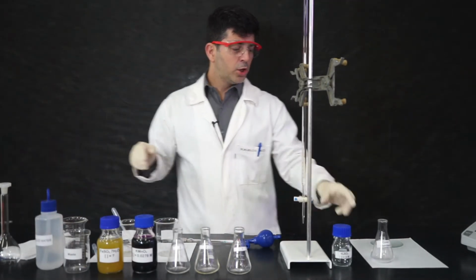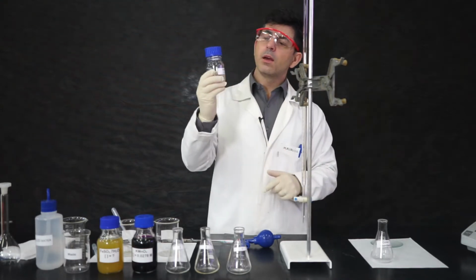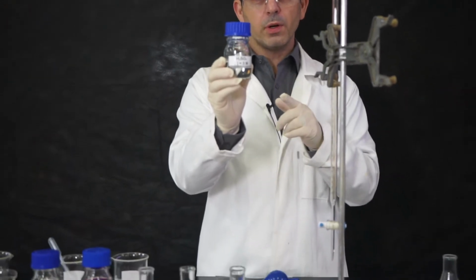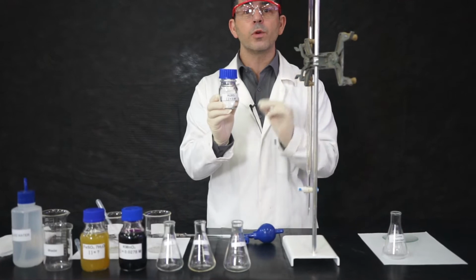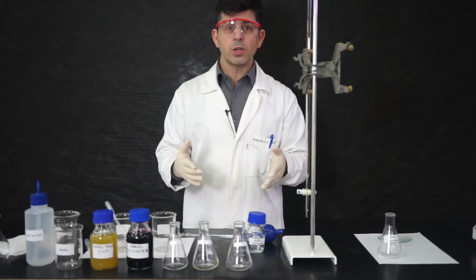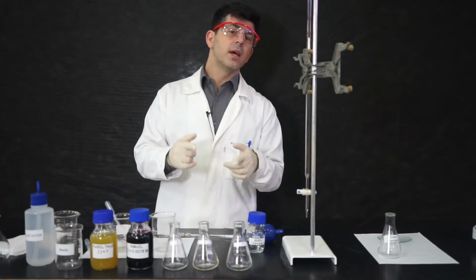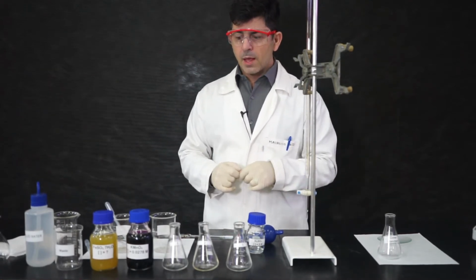and you will need sulfuric acid. Here, a 3 molar solution of sulfuric acid. This sulfuric acid will guarantee you have an acidic solution for the titration. You will have to find on the internet the chemical reaction we're going to perform here today. And you will see when you find it that you need sulfuric acid to make sure the solution is acidic.